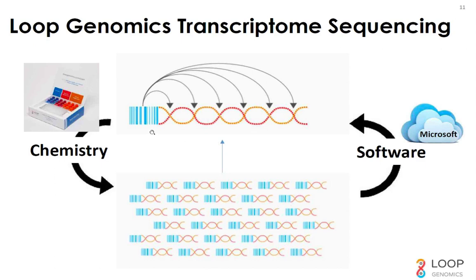And this ability stems from this enzymatic reaction, from our ability to copy and paste the barcode intramolecularly into multiple positions. That means that every part of the long molecule will be tagged by the same UMI because it's intramolecular. And then when we make short reads out of those molecules, every short read that originated from the same molecule will have the same UMI, which means that if we group all the short reads that share the same UMI, we'll be able to reconstruct the sequence of the original long molecule.